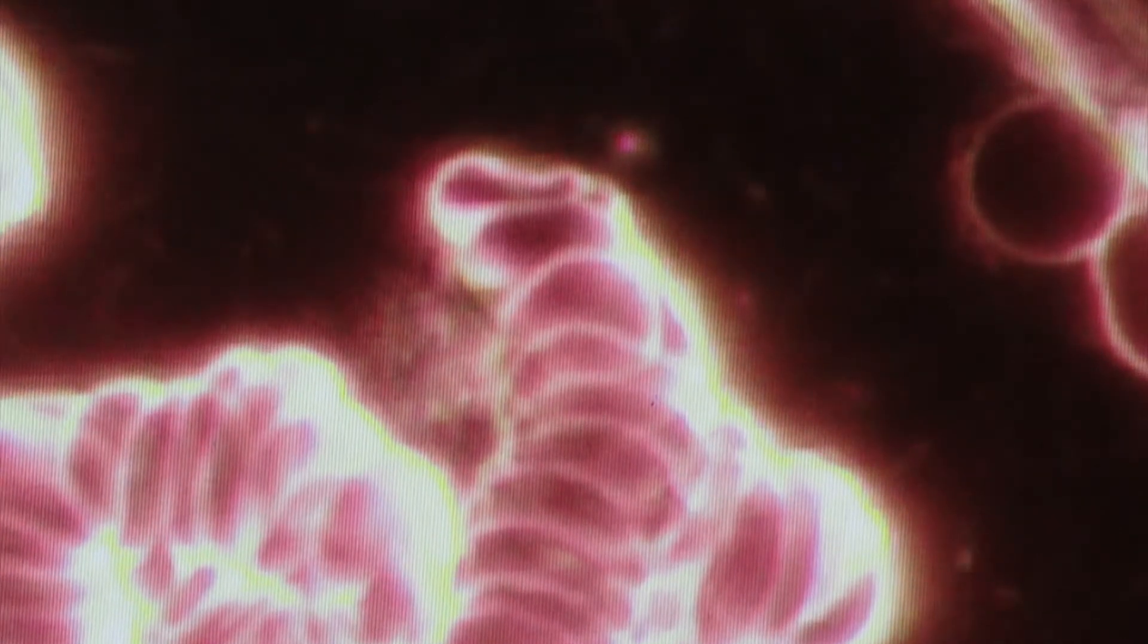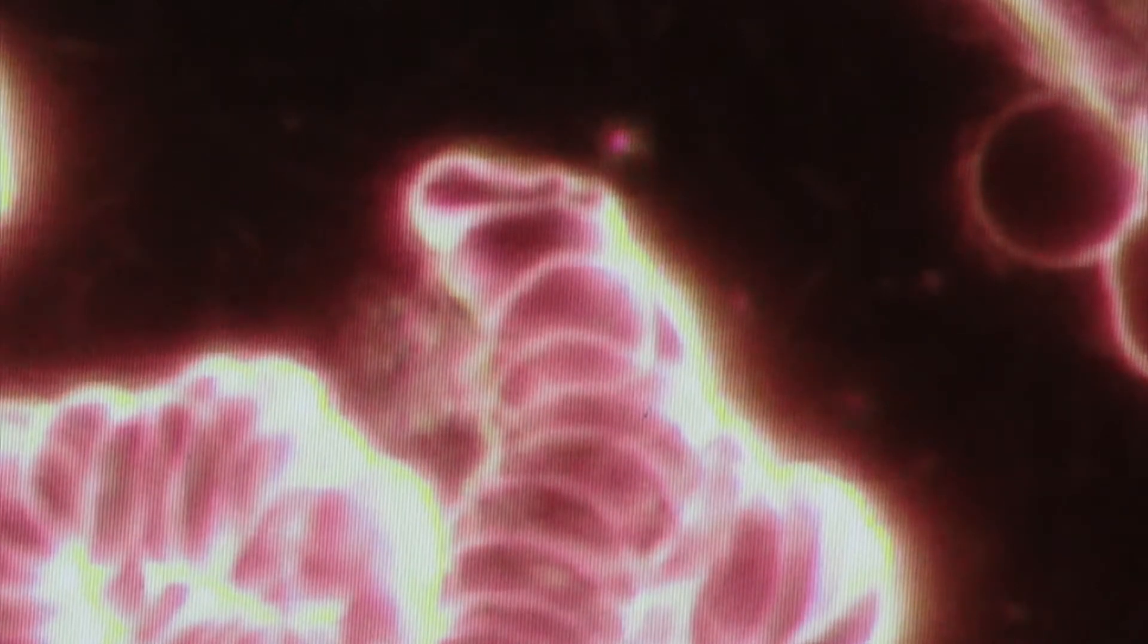What is it showing us? It's just showing us that your food is making its way into the blood and it's not staying in the gut. Now the gut is not a sealed environment, so some food will certainly get into the blood, which is why we see the snowflakes happening. These are safe. This kind of thing will cause gas and cause bloating, digestive upset. You definitely want to make sure that you're chewing your protein foods really well. I'm drinking them, it's soup. You tell me, it's a couple days old. Chew my soup.